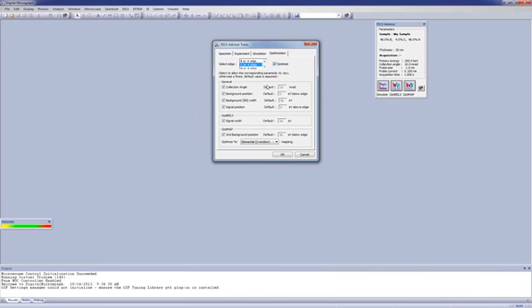When we do that, you can see that the parameters below are enabled. And in addition to the parameters being enabled, you can see the checkboxes are all selected and set to on. What this means is that the software will now allow the collection angle, the background position and width, and the signal position and width to vary.